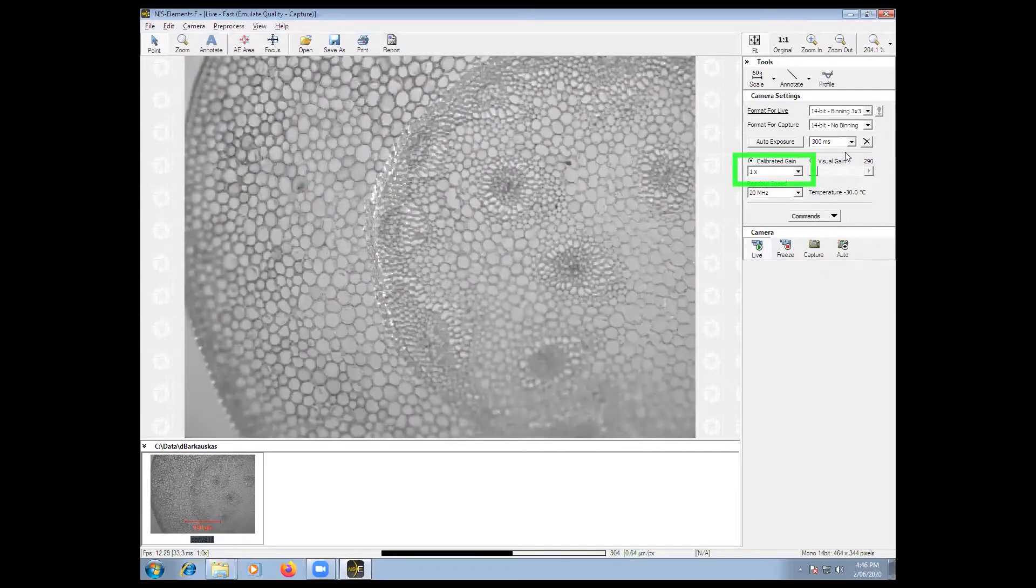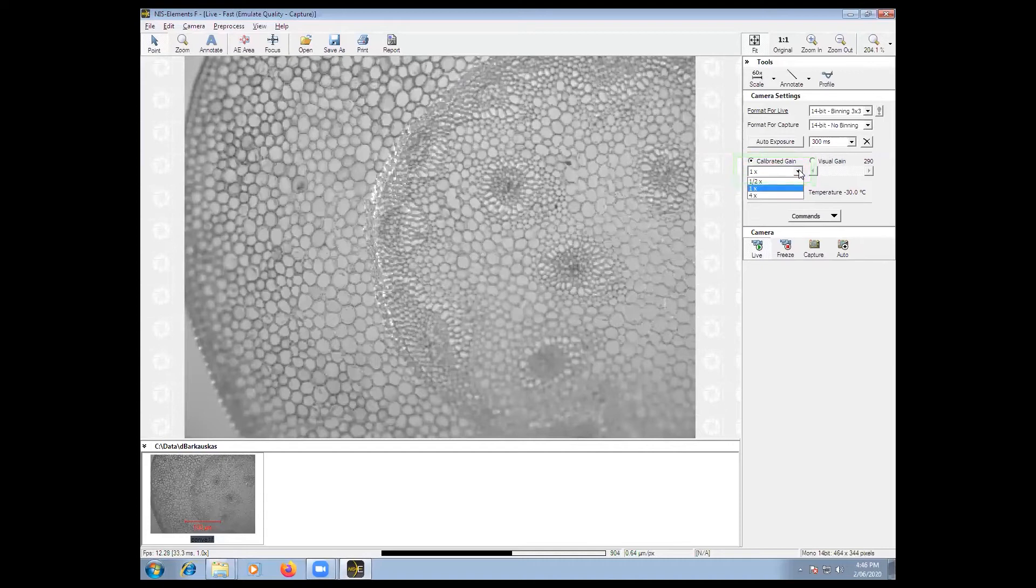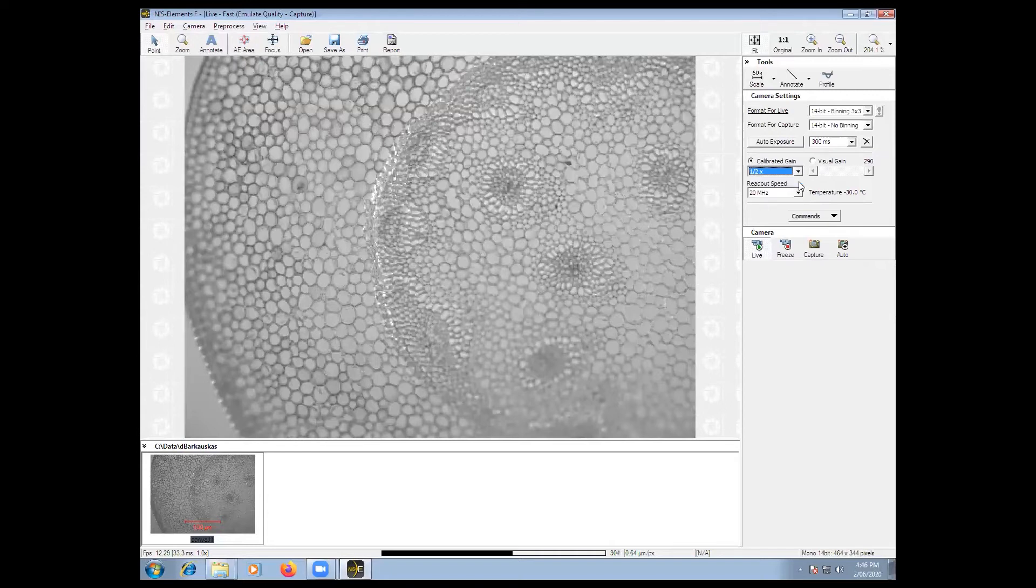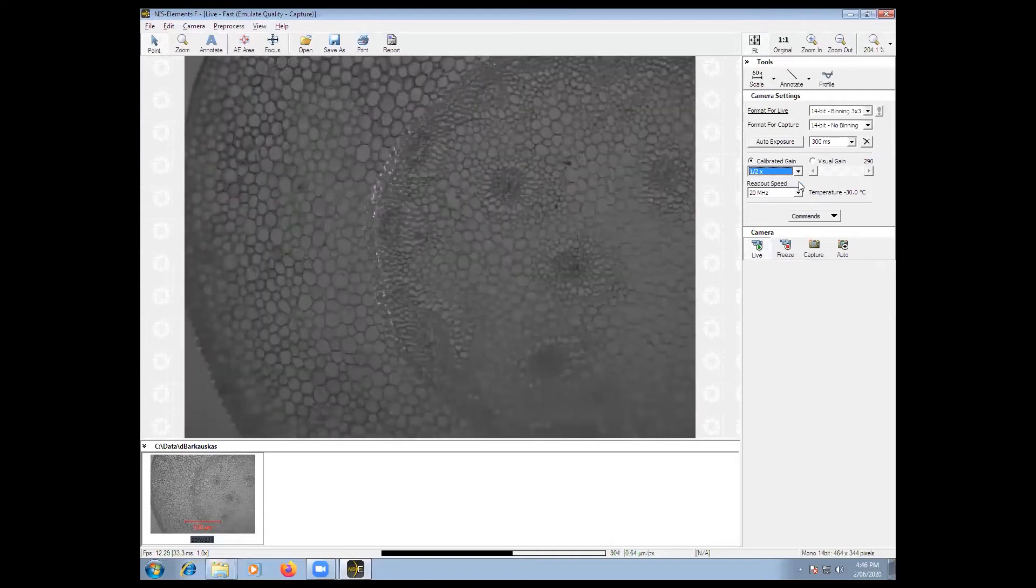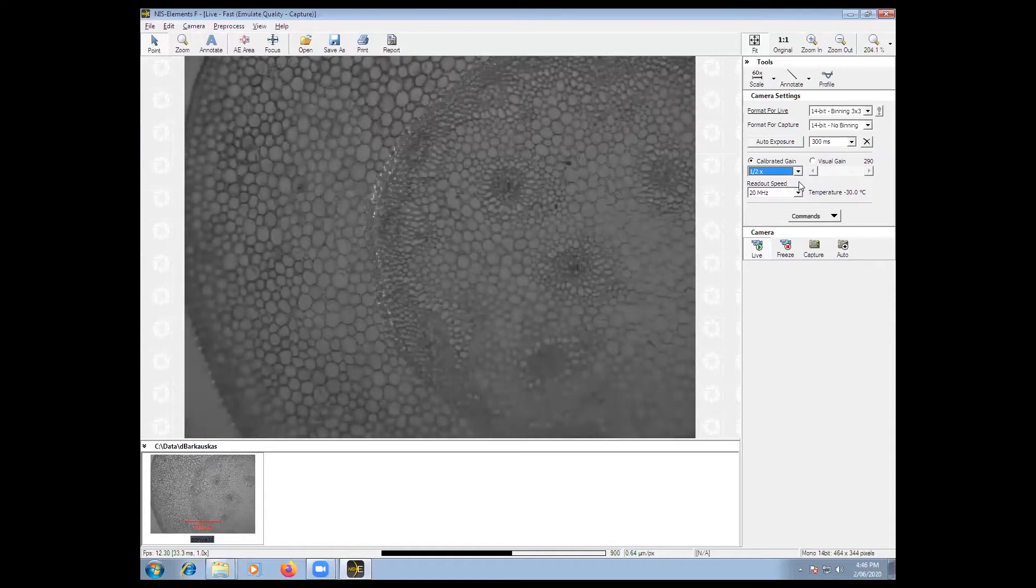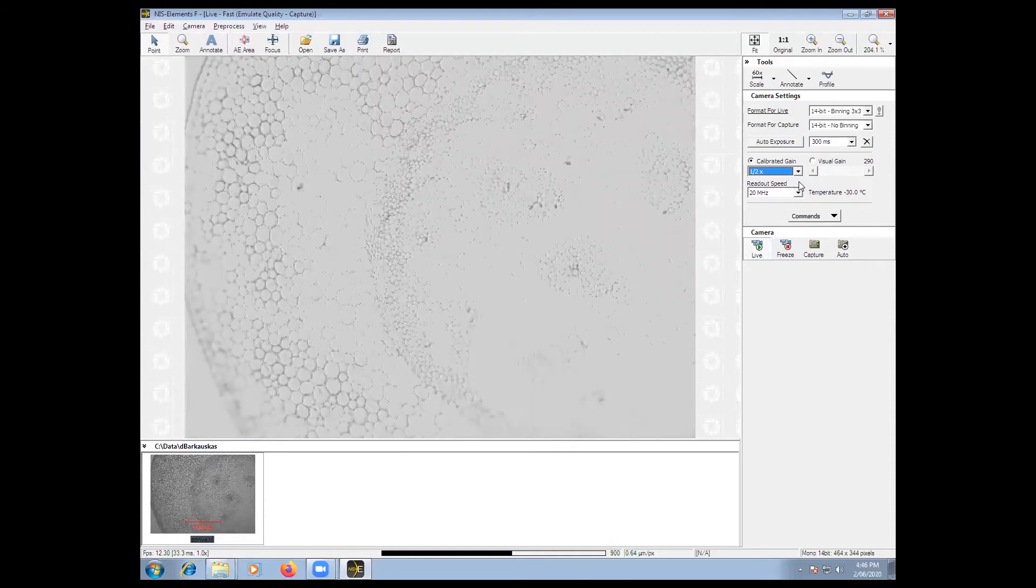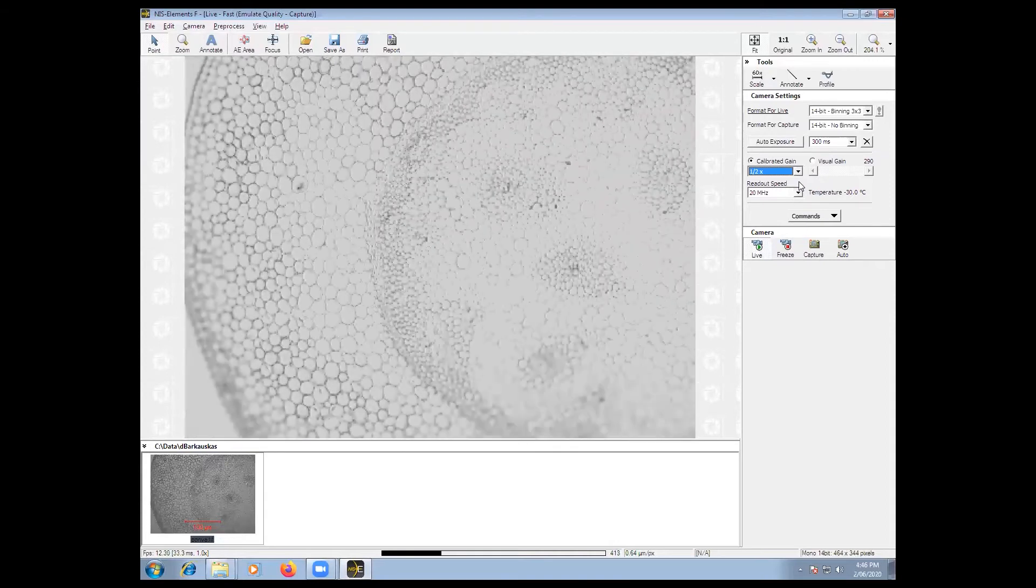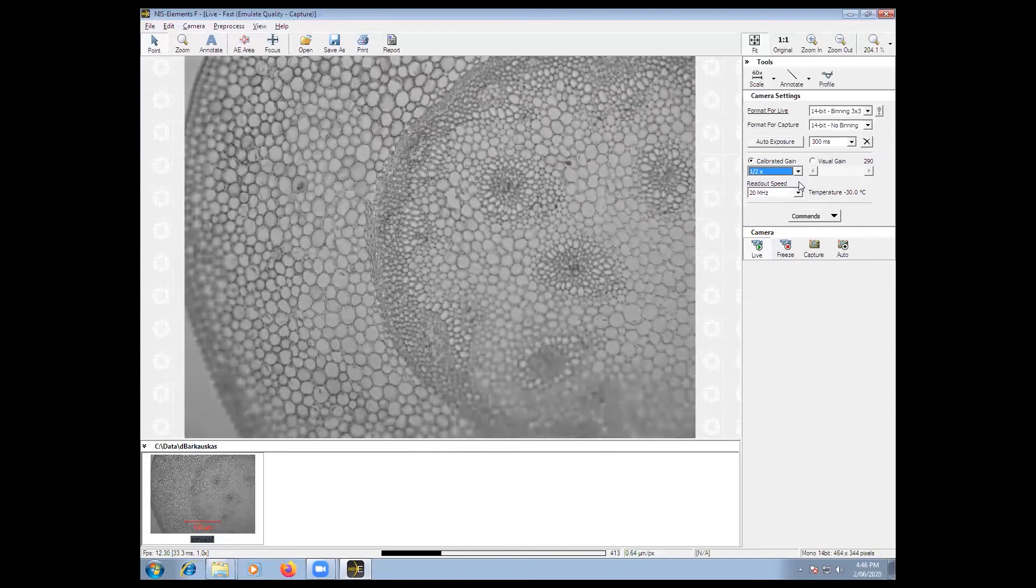If you need to enhance the contrast in your image, you can try to change gain. It defaults to 1, but if you have a bright sample you can try to decrease the gain and it will decrease the brightness in your image.